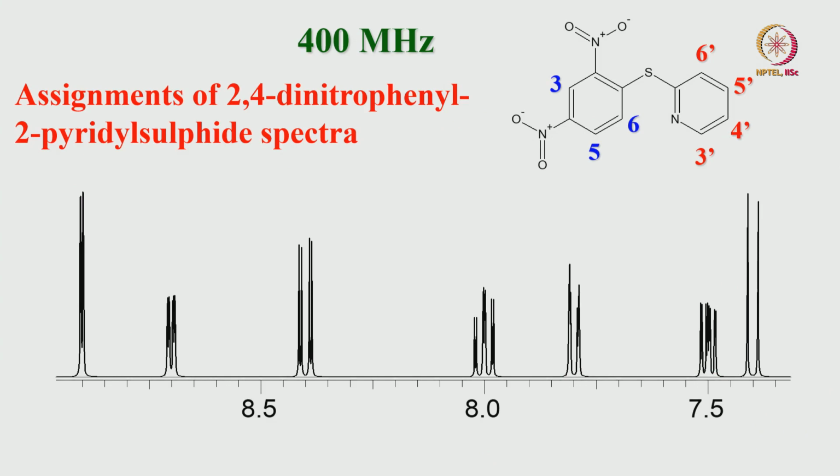simple molecule. See, this molecule is a little bigger molecule. We have 7 chemically inequivalent protons, 4 of them situated in this phenyl ring and 3 situated in this phenyl ring. If you start looking at it with the idea I already have given you, you have to look at the phenyl ring which experiences ortho coupling, meta coupling, para coupling, etc. Start thinking.